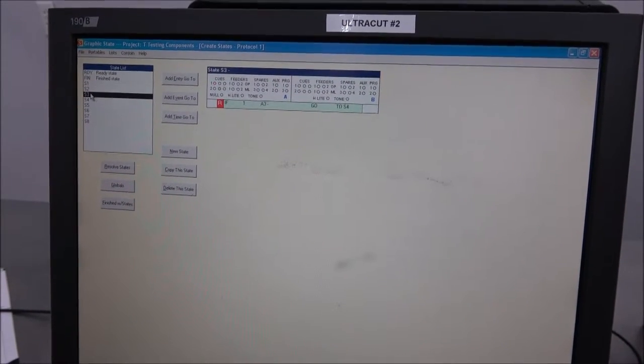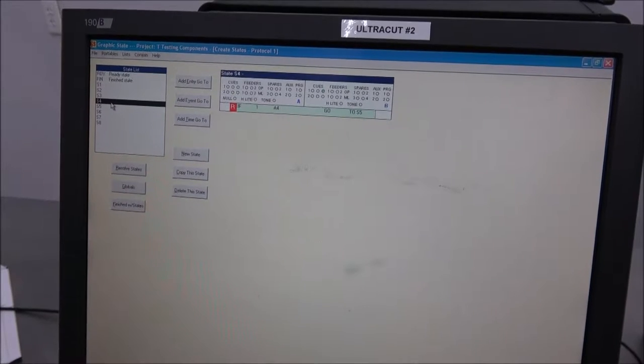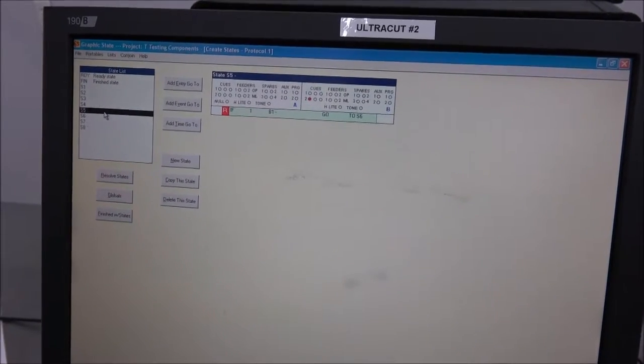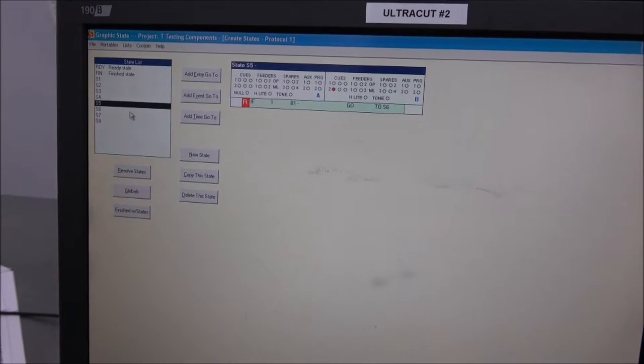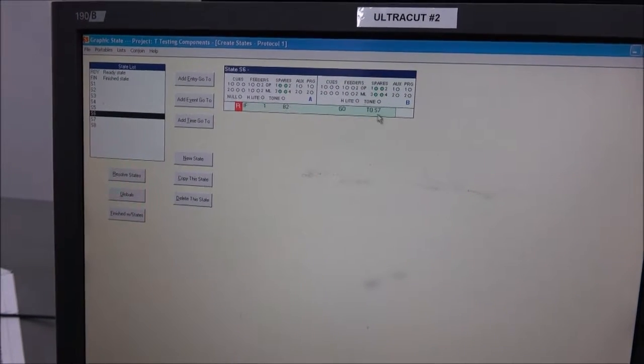You're going to go three to four, four to five. That would be five, but you're on a new board, so that's now five on the six, six to seven.